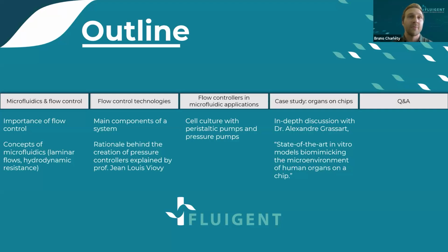Next, I will illustrate the performance of some flow controllers in a typical microfluidic application, cell culture under flow. And finally, Dr. Alexandre Grassart will provide an in-depth discussion into the use of flow controllers with specific case studies in organs on a chip.